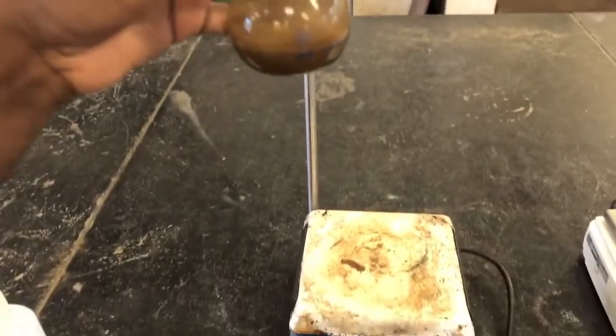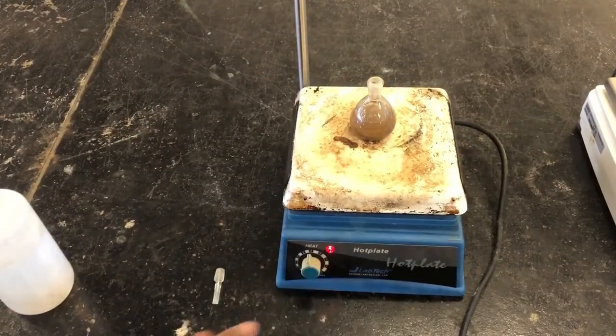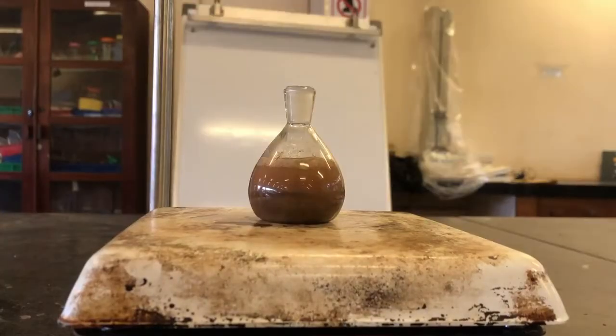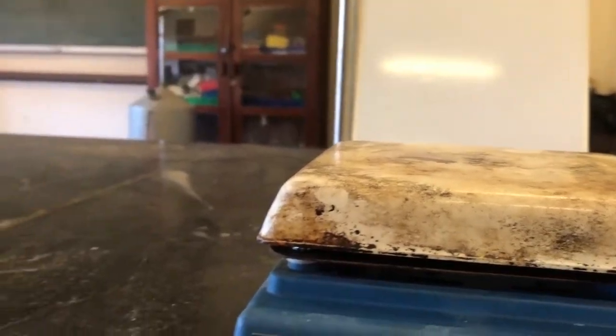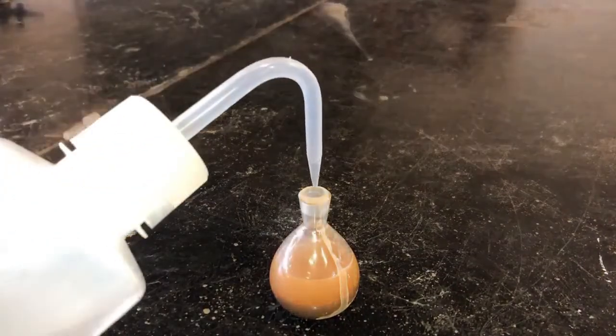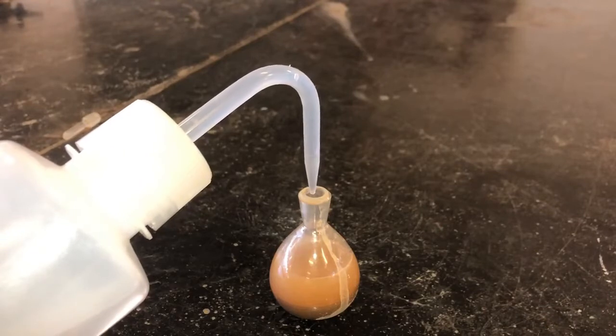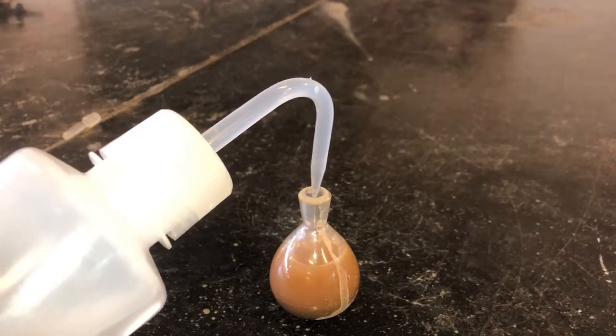Then keep the bottle on a hot plate. We have to boil the specific gravity bottle without the lid for about 5 minutes until the entire entrapped air is released. As it is sufficiently boiled, now we have to take the specific gravity bottle away from the hot plate. Cool the bottle until it reaches room temperature and fill the bottle with distilled water. After completely filling, we have to measure its weight.